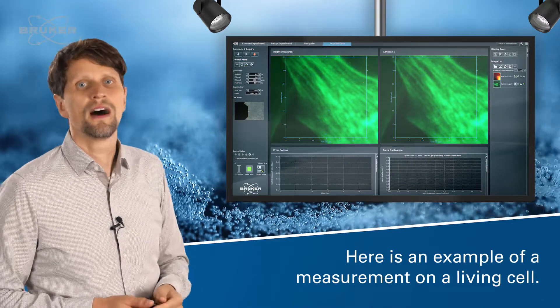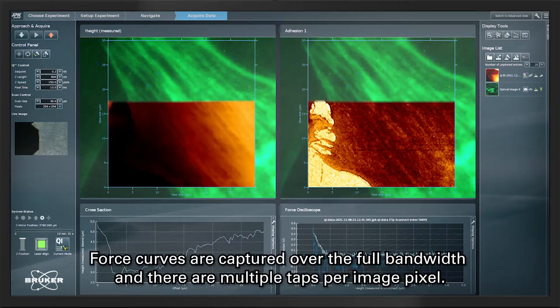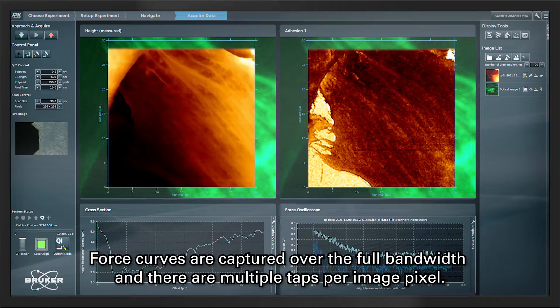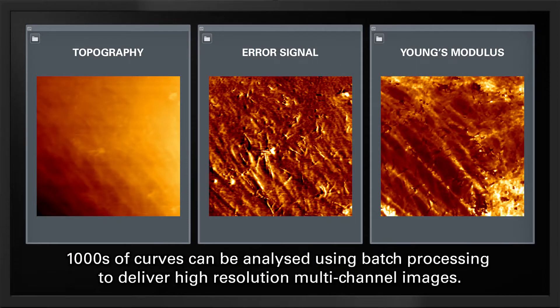Here is now an example of a measurement on a living cell. Force curves are captured over the full bandwidth and there are multiple taps per image pixel. Thousands of force curves can be analyzed using batch processing to deliver high resolution multi-channel images.